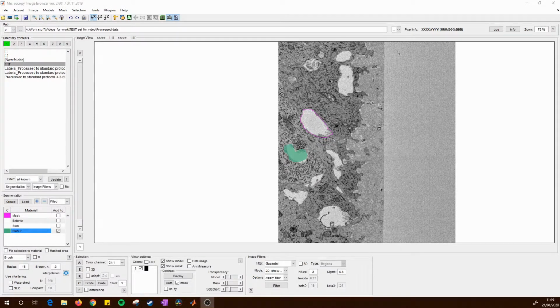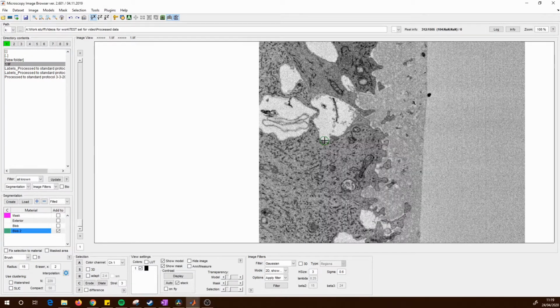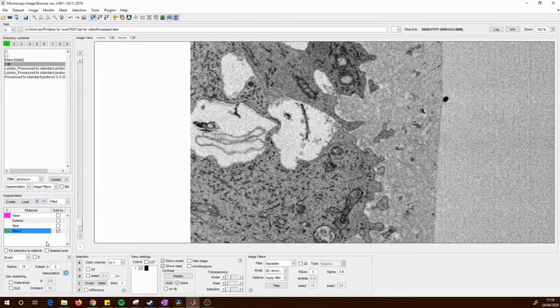I'll now show you the tools in more detail. So the brush tool, there's a couple of options I'm going to go over for now. I'll leave these other options for when I do a more advanced description of the tools. But you can change the radius manually here. You remember earlier I said you could do Control click. So yeah, I'm just holding Control down and scrolling, sorry, not clicking.